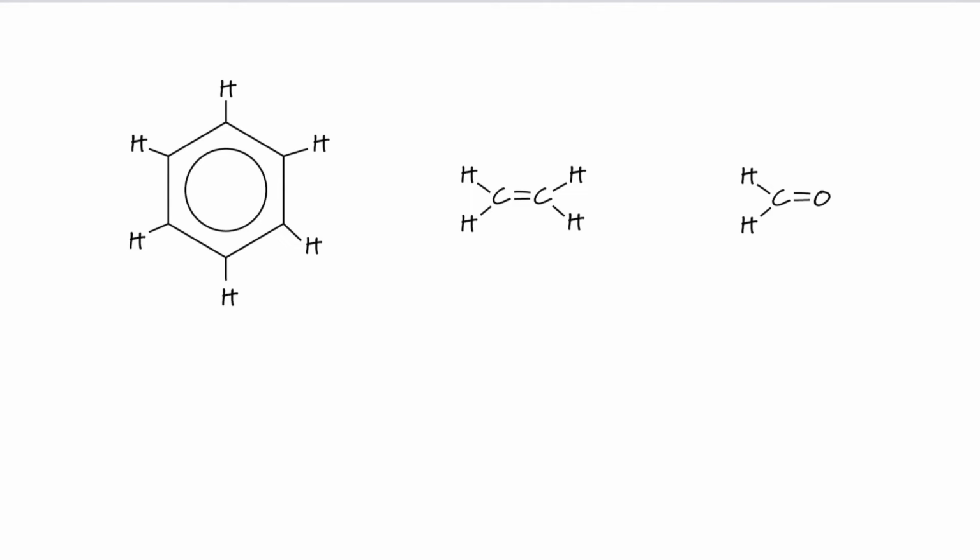These three types of molecule or functional group all have delocalized pi electrons, either as part of a ring system, as in benzene, or as part of a double bond. And when we place these molecules in the external magnetic field, which is what is happening when we're doing NMR spectroscopy, the delocalized pi electrons begin to circulate. So we have our pi electrons circulating in the ring system, in the double bonds, whether it's a carbon-carbon double bond or a carbon-oxygen double bond.